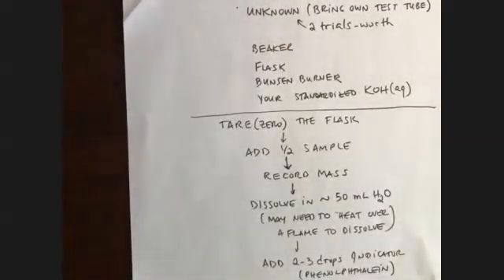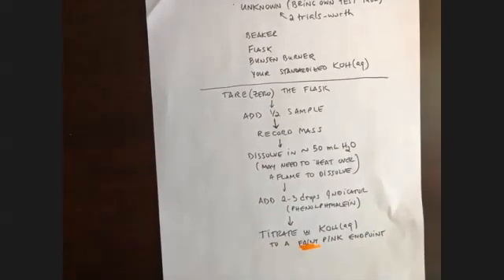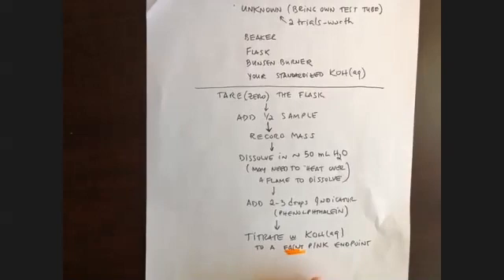Remember that when you do a titration, you titrate to a faint pink endpoint. What happened last time, remember? Right. Some of us, when we try to do that, we overshot the endpoint. We went way overboard and overshot it. And what did we do back then? Well, what we did was we were told that we had to discard that titration and do another trial until we could get 2 good titrations that differed by less than 5% from each other.